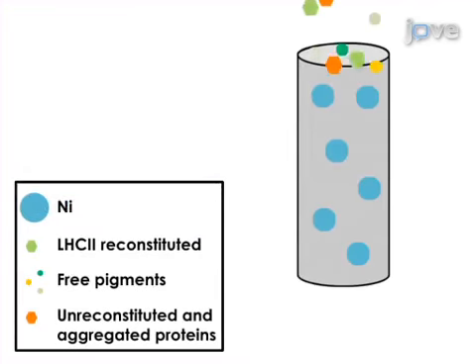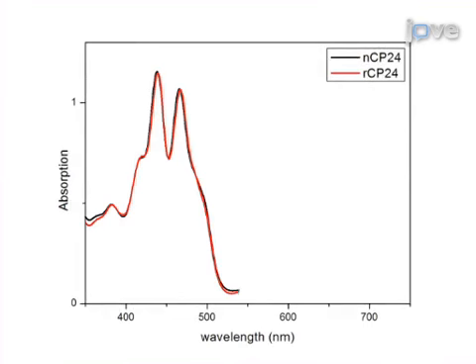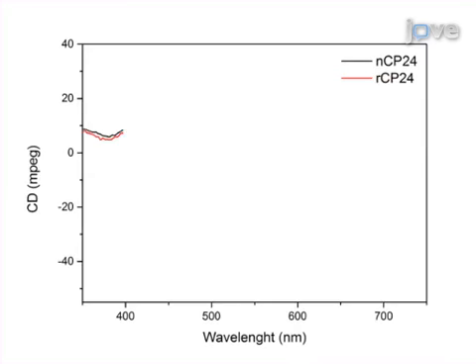Next, the reconstituted pigment protein complex is purified from the excess pigments and the unfolded protein. Results are obtained that show similar spectroscopic characteristics of the reconstituted pigment protein complex and the native one based on absorption spectra, fluorescence spectra, and circular dichroism.